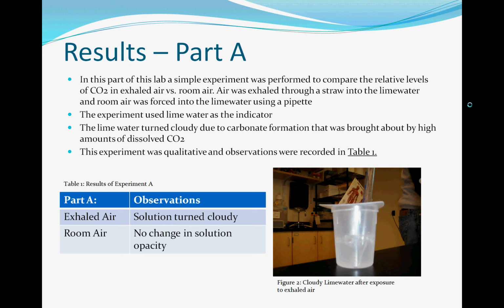For the first experiment, we wanted to compare the CO2 content of exhaled air versus room air. Lime water was used as an indicator, and exhaled air was first blown through a straw into the lime water. Table 1 records the results of this experiment. The exhaled air produced a cloudy solution within the beaker, while when the room air was bubbled through, no change in solution opacity was observed. This experiment qualitatively tested the concentrations of CO2 in the two kinds of air.